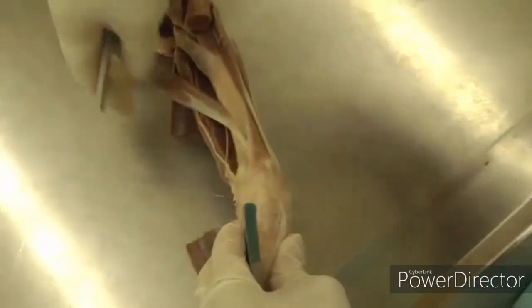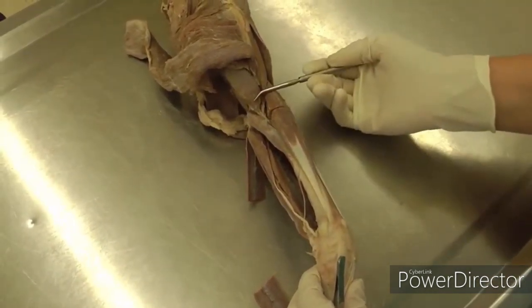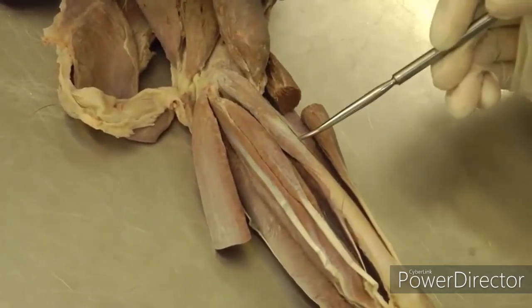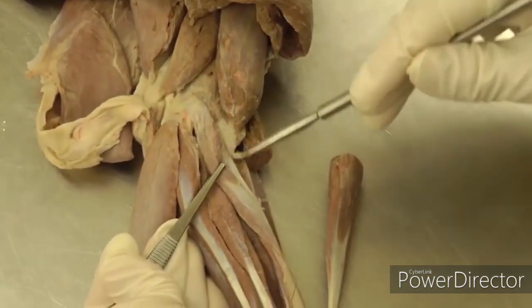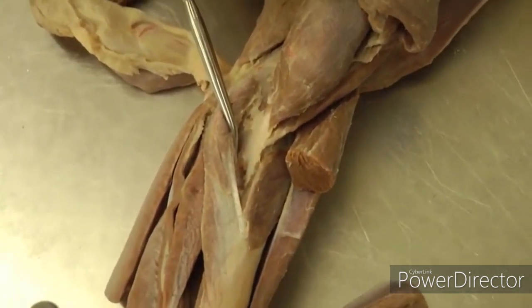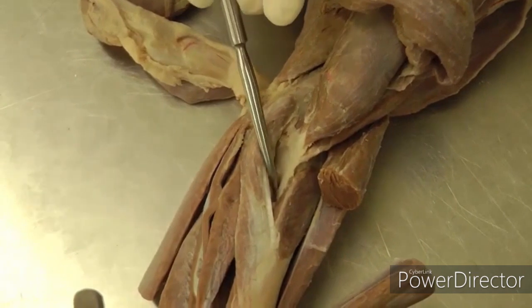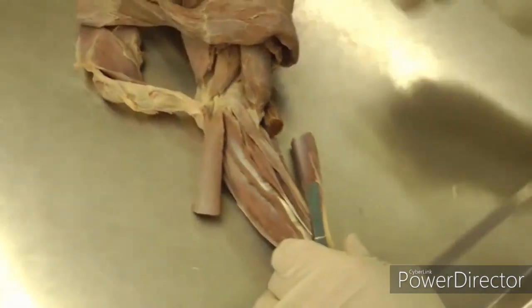Turning to the medial aspect, starting again at the extensor carpi radialis for orientation on the cranial aspect of the brachium, we'll move just medial to that. We're going to start with the pronator teres, which is right here. The book is going to tell you to look at the tendon of the biceps underneath the pronator teres and dissect in that area. The tendon of the biceps bifurcates — it's got two tendons of insertion — and then the brachialis tendon is going to insert in between those two tendons of insertion.